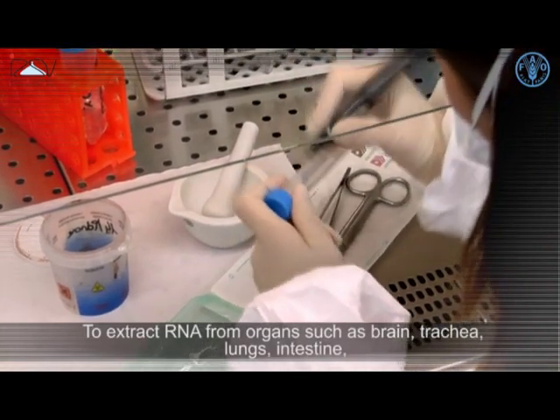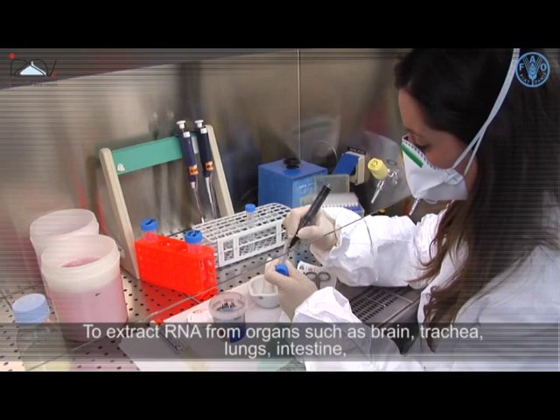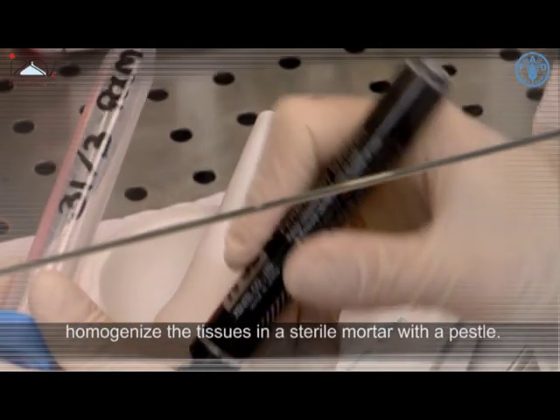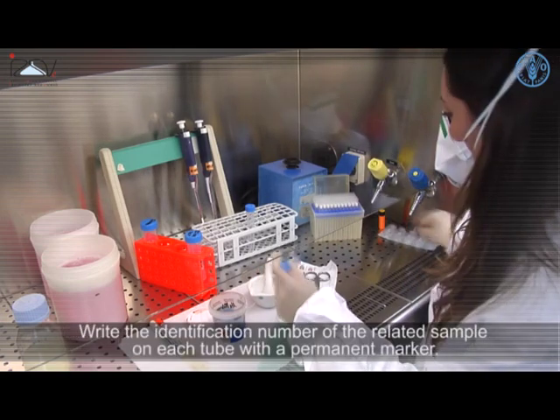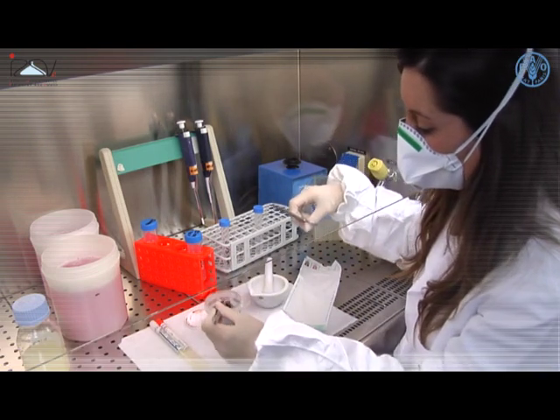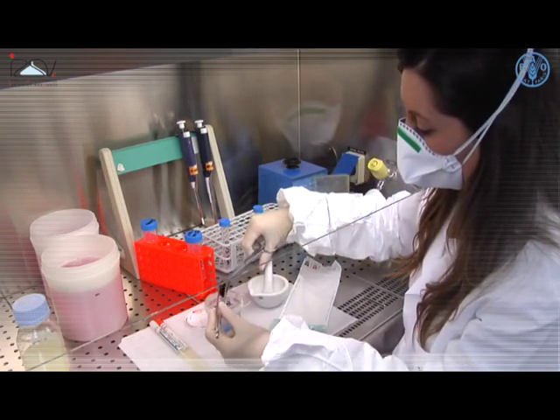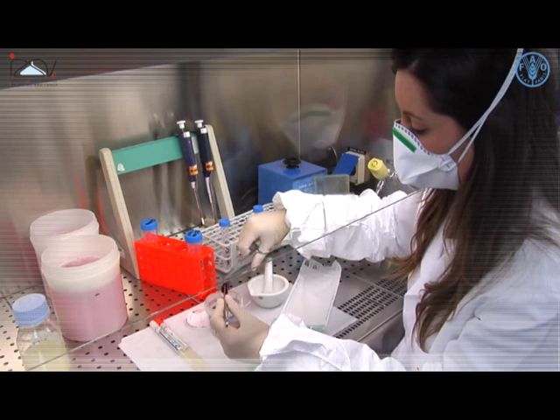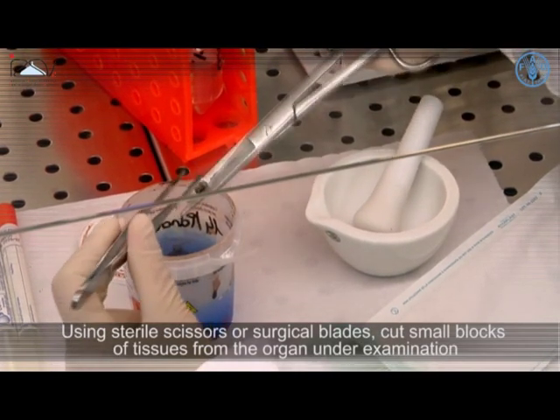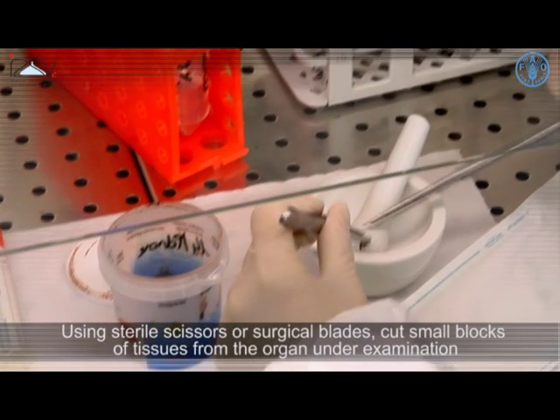To extract RNA from organs such as brain, trachea, lungs, and intestine, homogenize the tissues in a sterile mortar with a pestle. Write the identification number of the related sample on each tube with a permanent marker. Using sterile scissors or surgical blades, cut small blocks of tissues from the organ under examination.